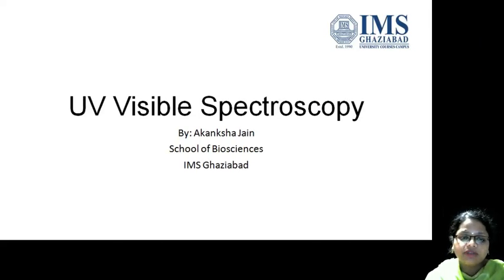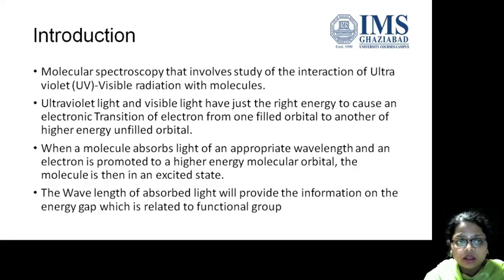Hello students, today we are going to discuss UV visible spectroscopy. It's a molecular spectroscopy that involves the study of the interaction of ultraviolet and visible radiation with molecules.